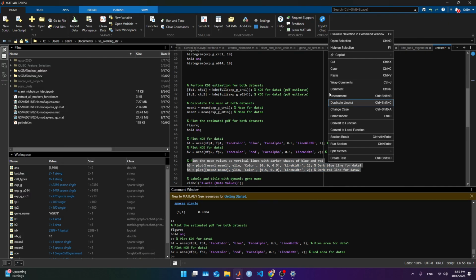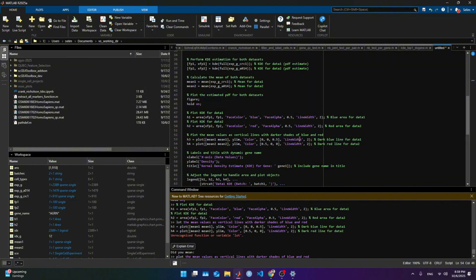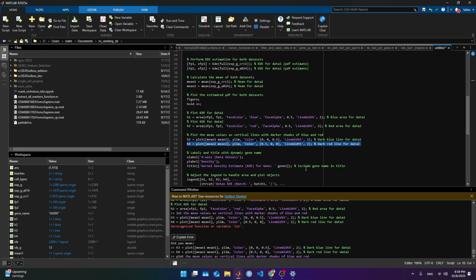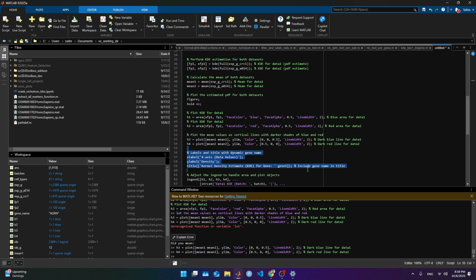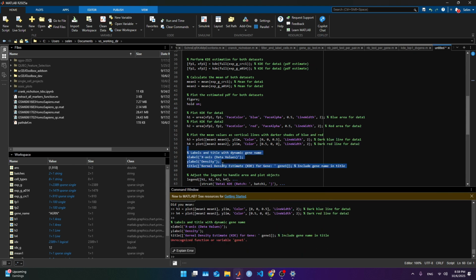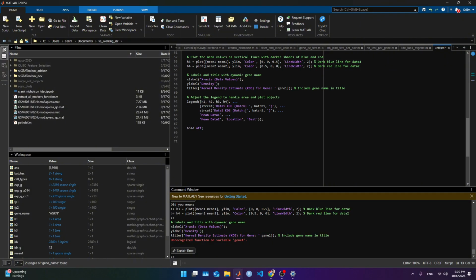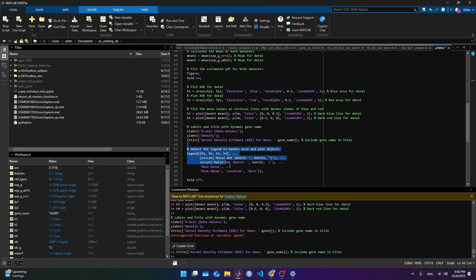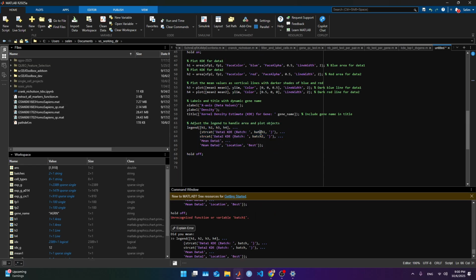Now we are gonna plot the mean expression. What happened? Is this working? Okay, that worked. Is this working? Okay, something happened, but it worked. Now we're gonna get this. This is gonna get the axis names labels, gene 1. So here instead of gene 1, it's gonna be gene name, to get the name on the plot. And get the legends and hold off. Hold off means don't get anything else.